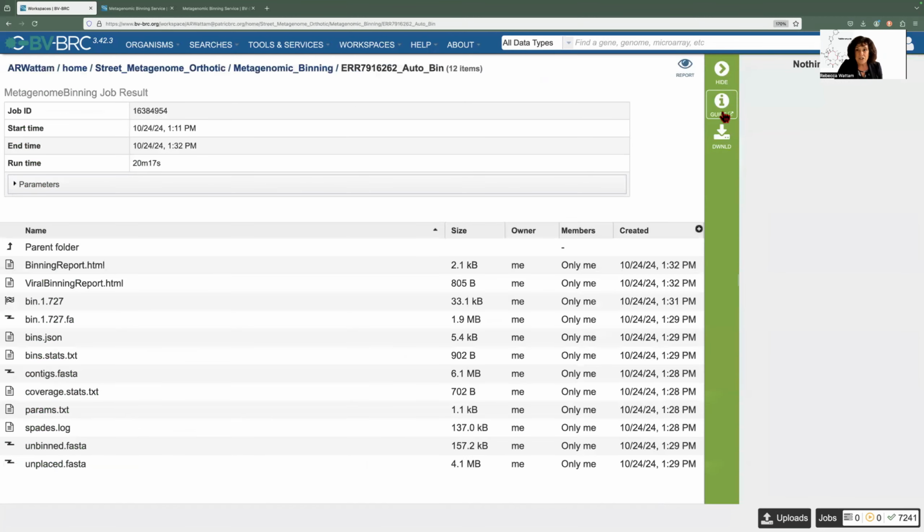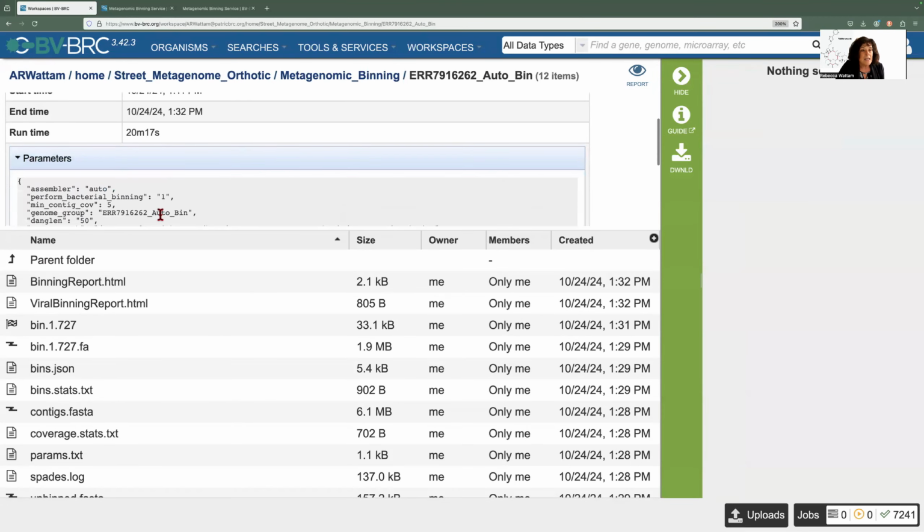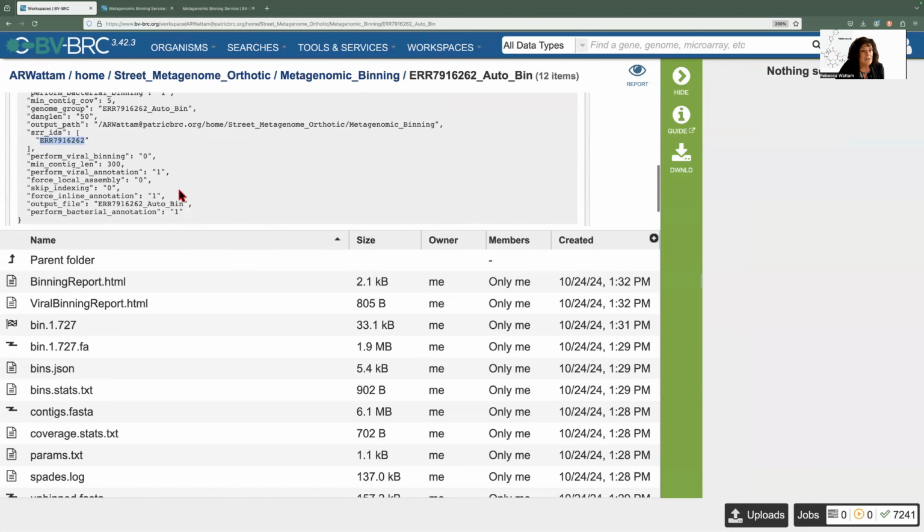All right, and this is showing me the results from this particular job. So remember, we talked about the results, the job number, how long it took, but the most important thing is this helps you remember what you submitted. And it tells me that that is what I submitted.